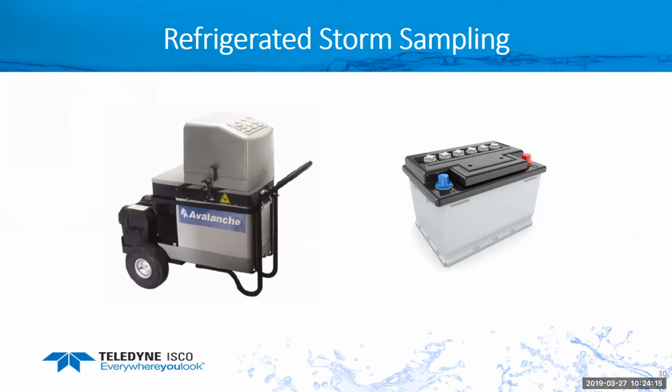It does require a lot more power because obviously you're using a refrigerator to keep those samples cold, whereas on the portables, you're just using ice to keep them cold. But of course, there's a lot more maintenance or human interaction there to make sure the ice is there before the storm starts. And also getting out there within 24 hours, well, 12 hours really, after the storm's done, so you can get those samples out. Just depends on how much ice you have in there and what the weather conditions are. If it's cold or if it's warm, those are going to impact your ice needs.